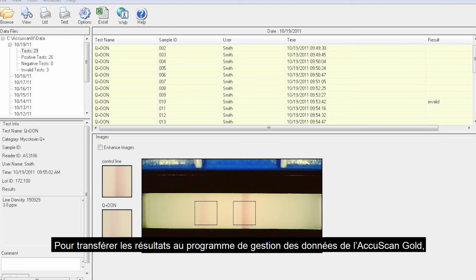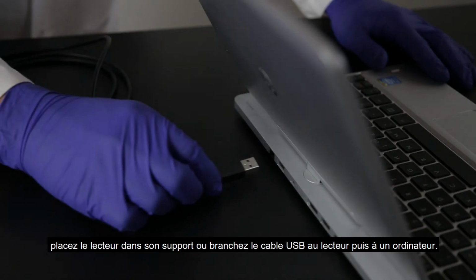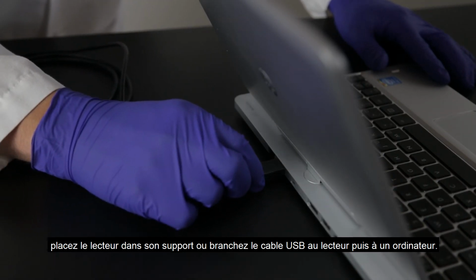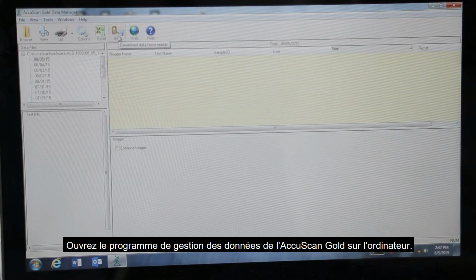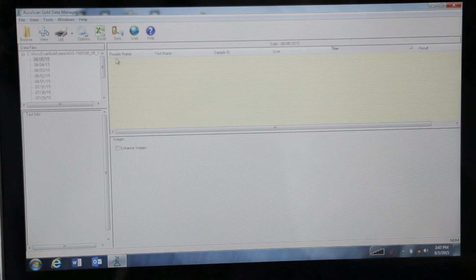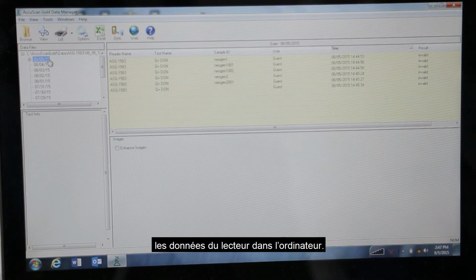To transfer the results to the AccuScan GOLD Data Manager program, insert the reader into the cradle or attach the USB cable to the reader and then to a computer. Open the AccuScan GOLD Data Manager software on the computer. Select the sync icon on the software to pull data from the reader to the computer.